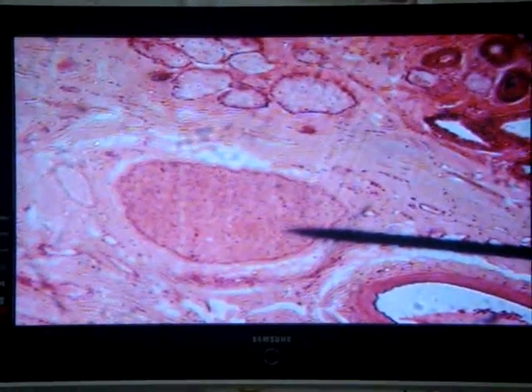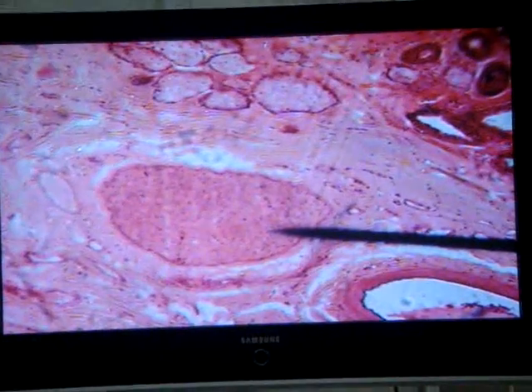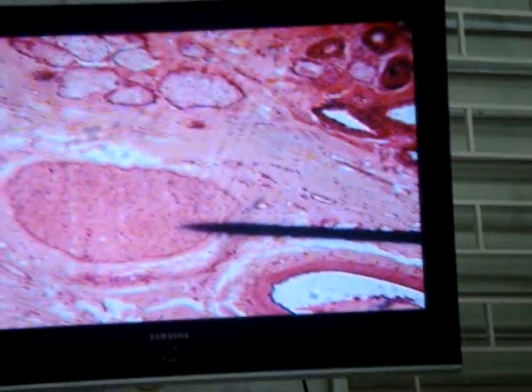And by the way, it's not uncommon either. In some skin, the dermis also possesses smooth muscle, like the muscle we see in the dartos muscle of the scrotum. Smooth muscle. Alright? So this concludes your little talk on endocrine and integumentary.